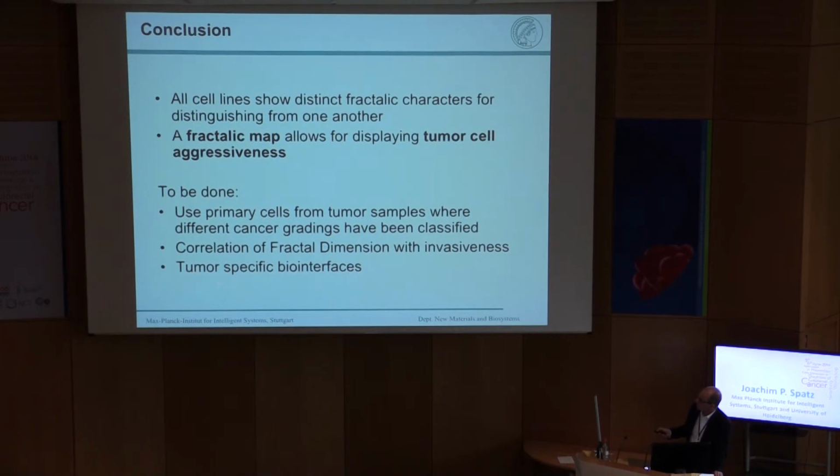And the other thing we can also add: for the measurements we have done so far, we just use, let's say, a fibronectin-coated substrate, or just an uncoated glass plate. But you could make this much more specific by developing biointerfaces which present a very well-defined ligand for, let's say, E-cadherins or for a certain integrin, which is expected to be highly expressed in a certain expected tumor cell.